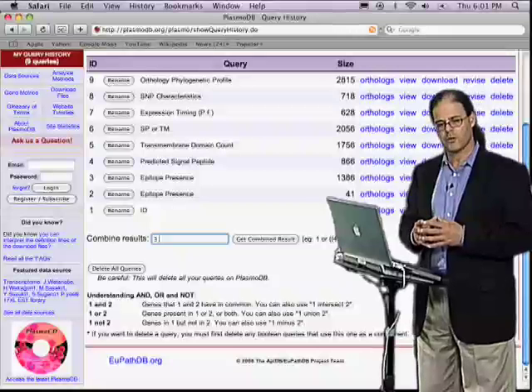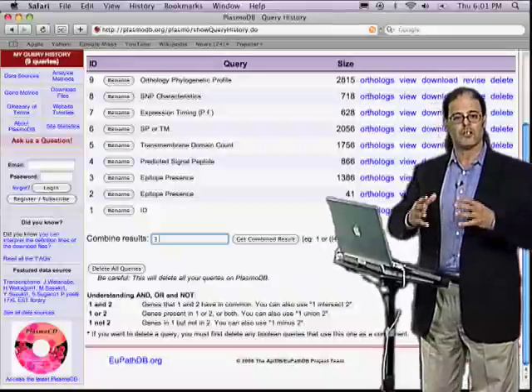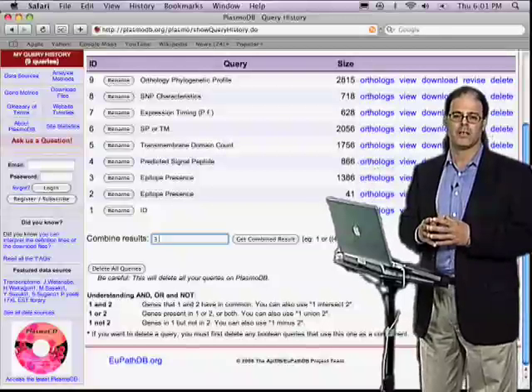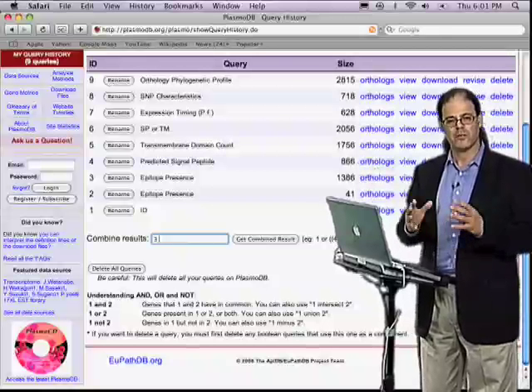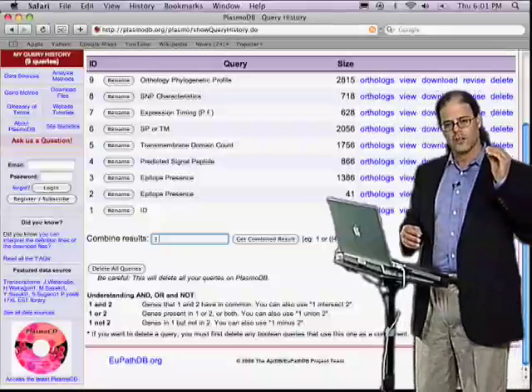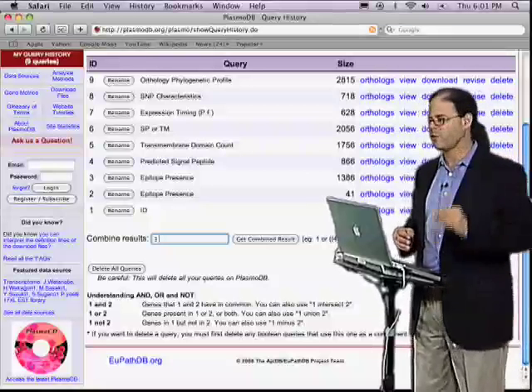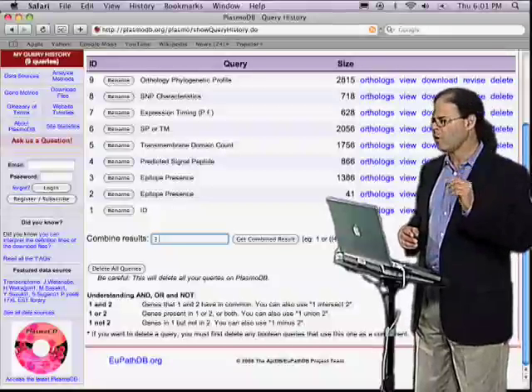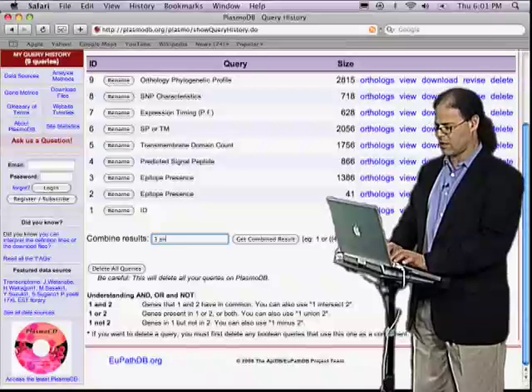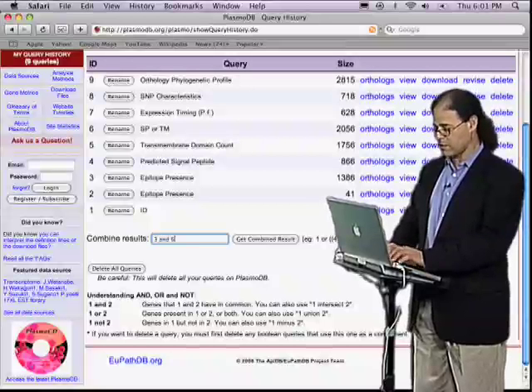I'm going to ask for proteins now, not for the union of proteins with signal peptides and transmembrane domains, as we asked earlier, but for the intersection of these various different queries. I'm going to ask for genes that have some level of immunogenicity and also have either a signal peptide or a transmembrane domain. So that was my question number 6.